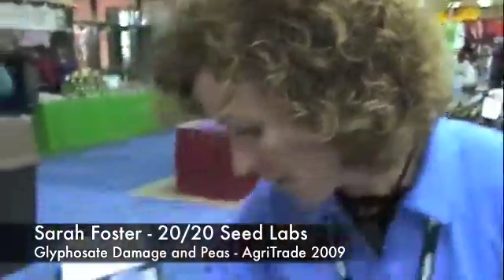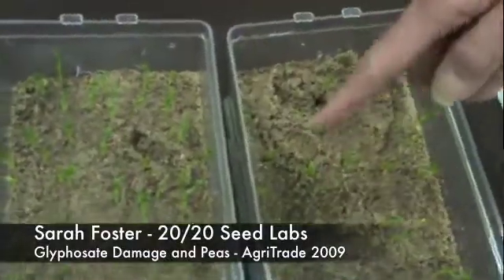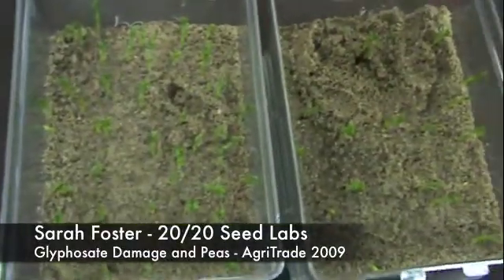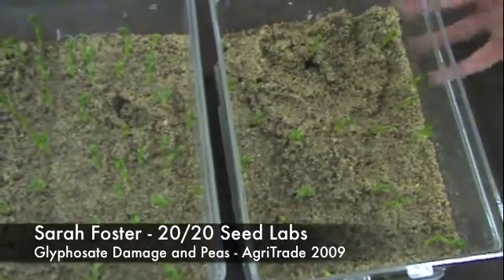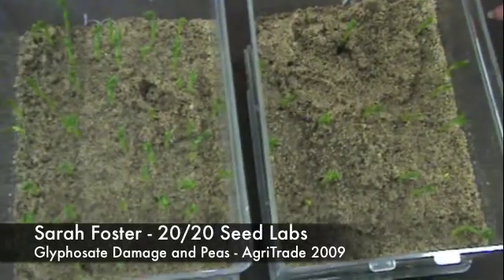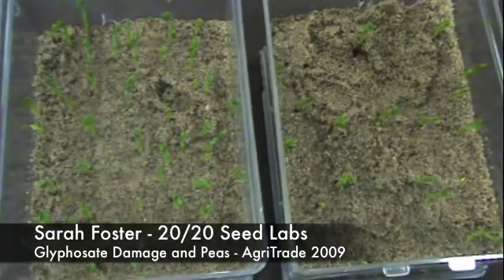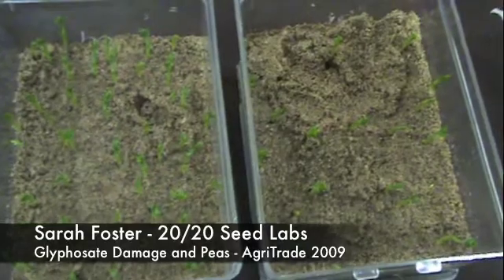As you can see here, this is a really good sample. There are 50 seeds in this dish, and all of those 50 seeds have actually germinated reasonably well. By comparison, this sample isn't that way at all. It's what really goes on underneath the soil surface — or in this case, the sand surface, which we use for germination.